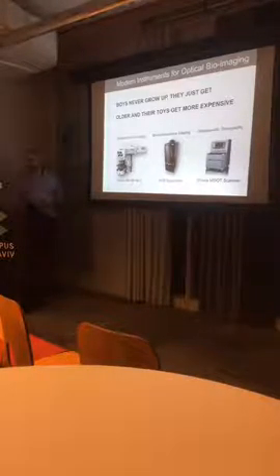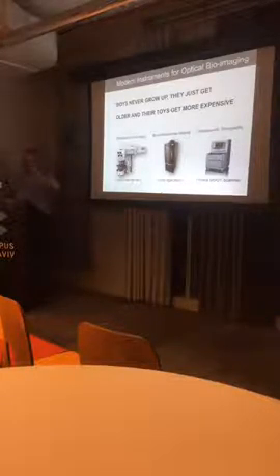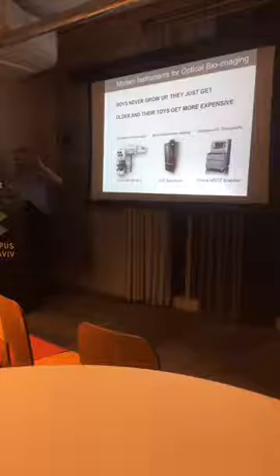I said half a micron depth, but you didn't say the resolution itself. Diffraction limit, it could be a quarter of a micron. For the depth, you say? No, for the spatial. The depth is about half a micron, because the Z resolution is a little bit lower, and it also depends on where we are. If we're close to the surface, the Z resolution is better. If we go very deep inside, it could be okay.